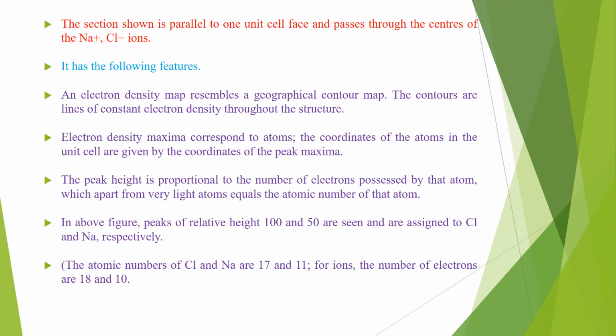The section shown is parallel to one unit cell face and passes through the center of the sodium ions and chloride ions. It has the following features.